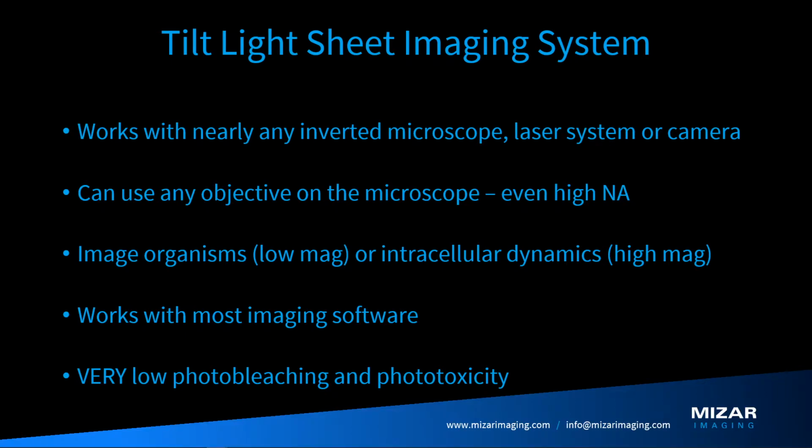The tilt works on nearly any inverted microscope, basically any laser system as long as it has a single mode fiber, and basically any camera. So if you already have a system that has a good camera, it's easy to add the tilt to it and use that existing camera. If you already have a system that's laser based and you have an extra fiber output on your laser, you could use that extra fiber output for the tilt.